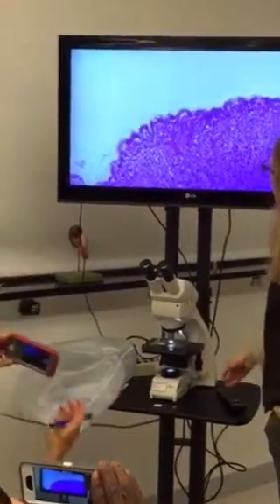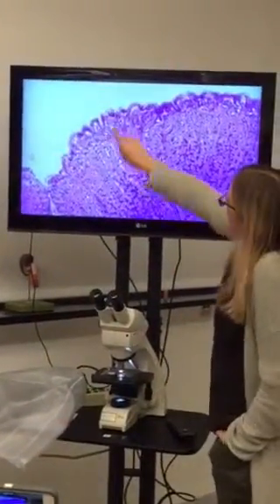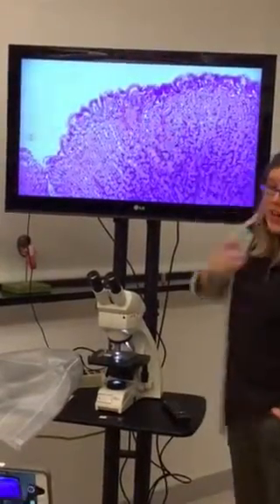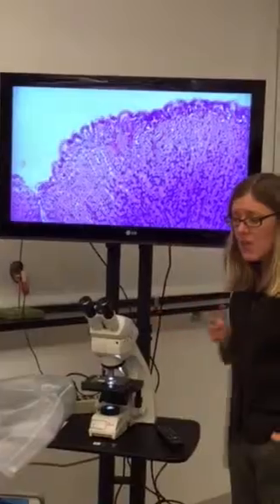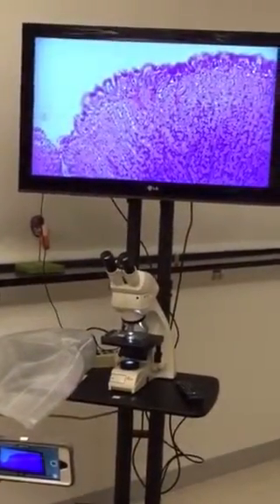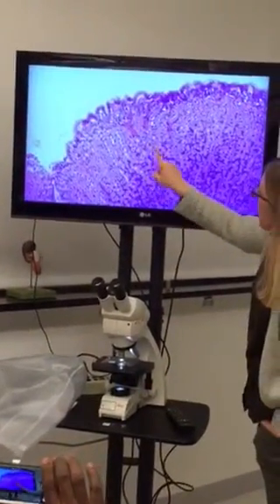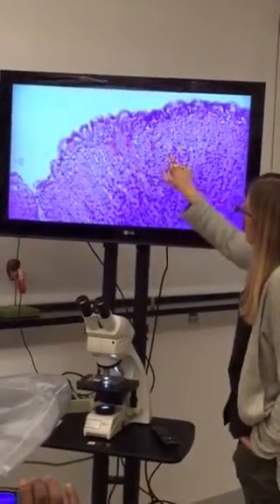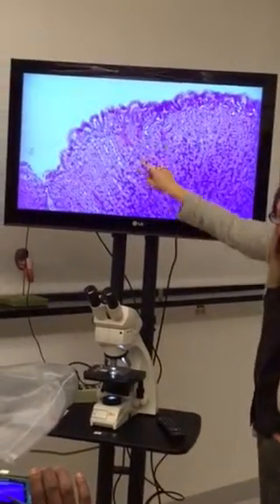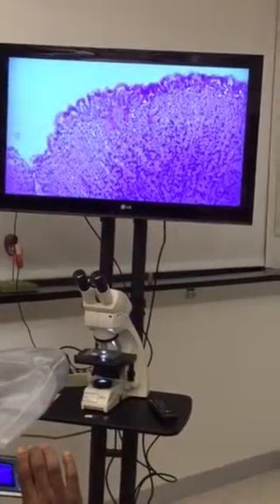Is that the same as the gastric glands? No. Okay, that's what I was just getting to. The little waves that you see actually are going deeper into the mucosa. Those are called gastric pits. Okay. Lining those gastric pits, there are mucus cells. Okay. More mucus cells. And glands releasing hormones too. So all of these, see kind of the lighter pink, all of this, that's where some stomach glands are. We're going to talk about whether they release mucus in more detail.